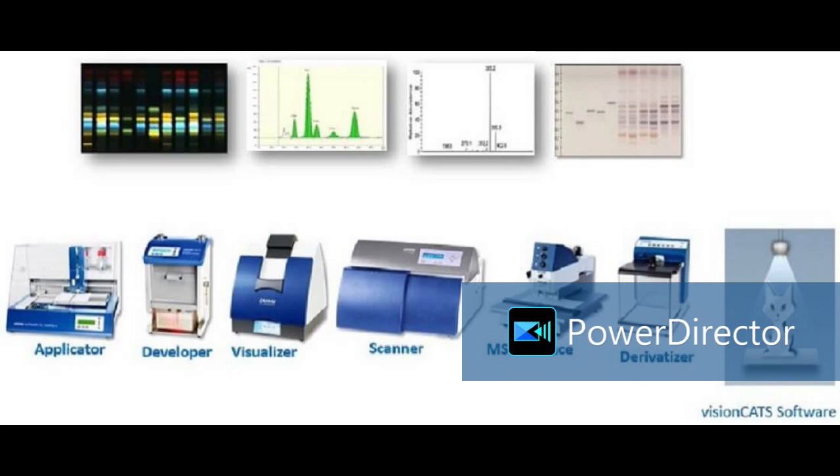Sir, ink analysis, you have asked about the HPTLC fingerprint of inks. So each ink has its own characteristic. For example, if it is the same manufacturer and the same ball pen was used, the inks can be similar. But if two different kinds of pens were used, or there is some difference in the ink, you will get different fingerprints.